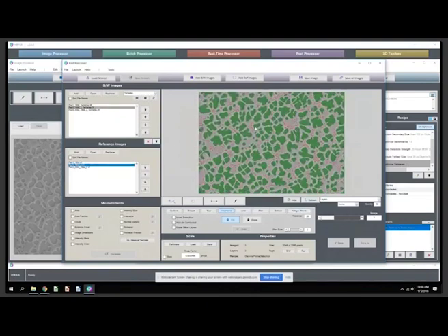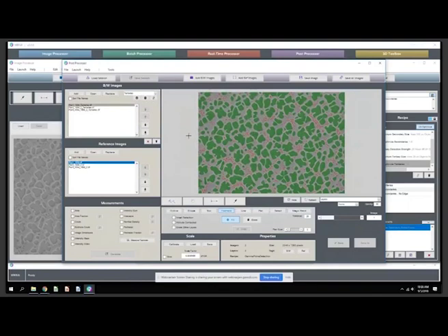And once you've evaluated your analysis in batch and are happy with it, then we can generate the same kind of report that we made on a single image basis, but on all images at the same time. So that might look something like, let's measure the area fraction again. And we'll go set up some feature measurements now.